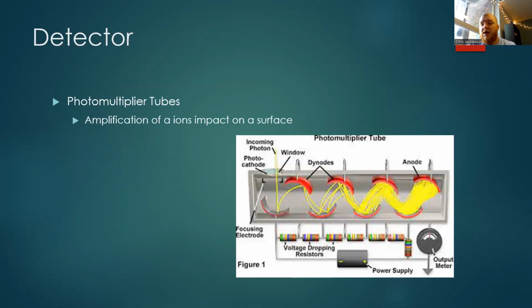Sorry about our detectors. Really, portable mass spec is just in line with the typical. The gold standard here is going to be photomultiplier tubes. Super basic. Funny enough, it's really hard to find good literature about portable mass spec detectors, just because the problem was never the detector. Photomultiplier tubes are not very big. They're pretty cost effective for what they're using.